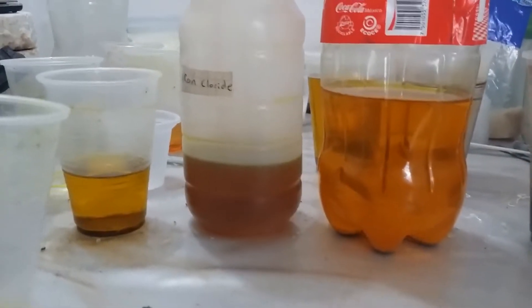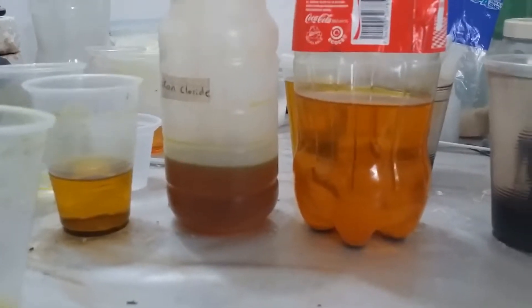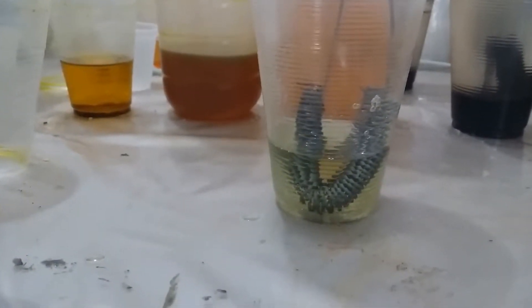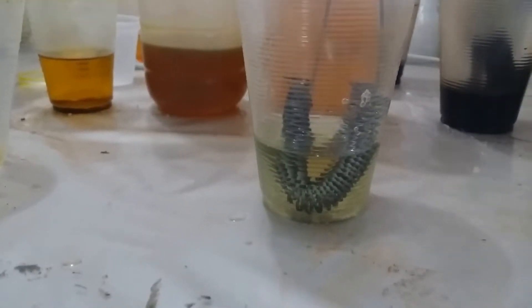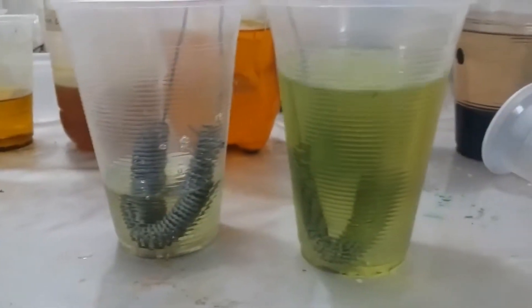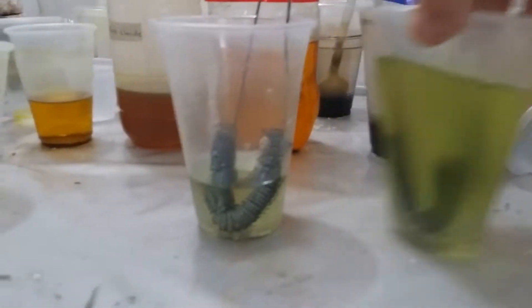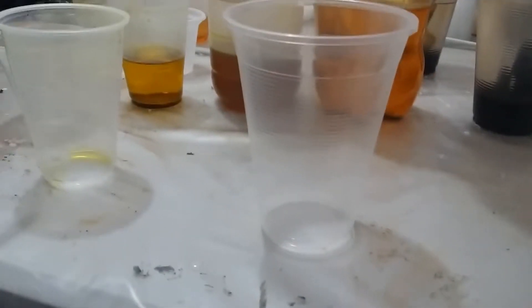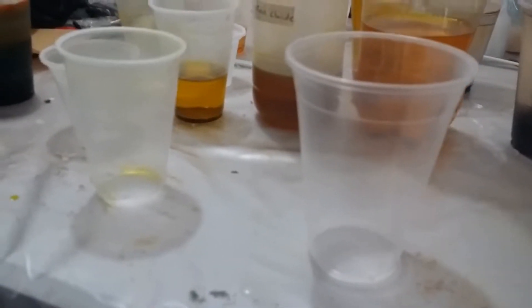They're both iron(III) chloride based on the color. If I soak the iron wire in there for a little while — it takes maybe six to eight hours — they turn green. You can see with that one there's a couple of them there; you get that green color pretty quick.